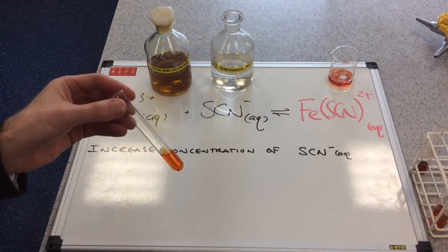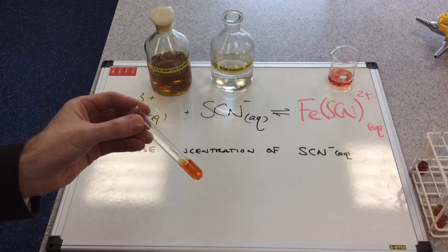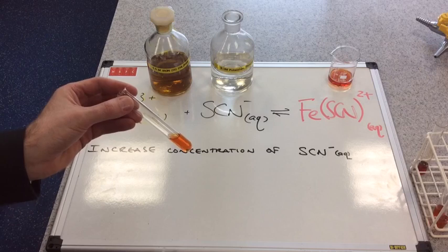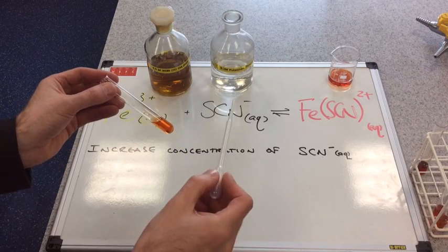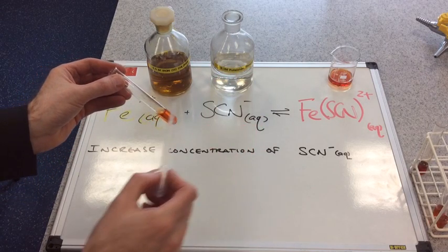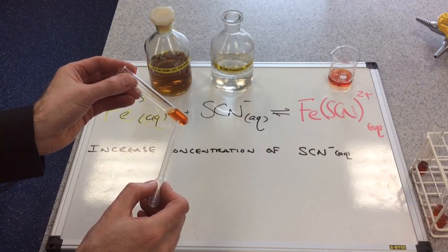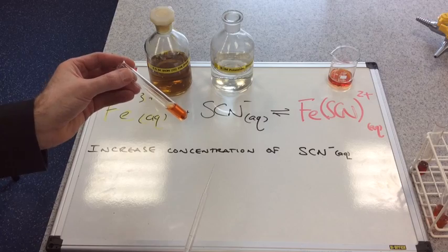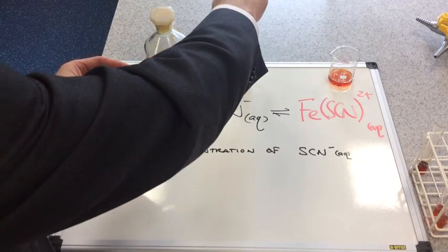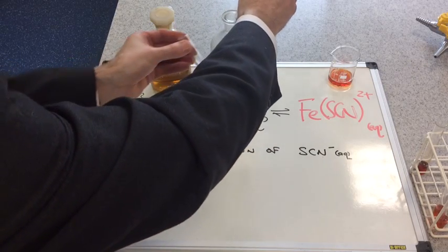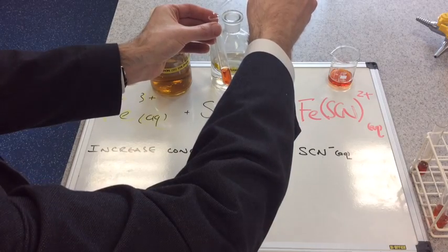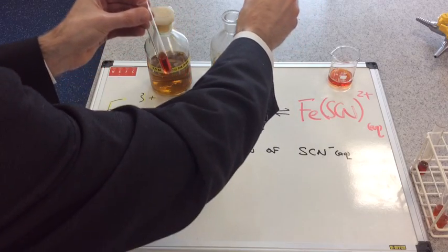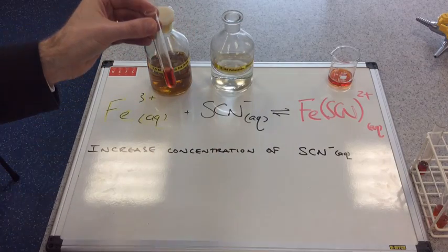The next change I'm going to impose on the equilibrium is I'm going to increase the concentration of the thiocyanate ion. So I'm going to do exactly the same thing. I'm going to get a drop of thiocyanate, add it to the test tube. This is the same color as the control tube and we'll compare the color when the new equilibrium is established. So we'll just draw a drop up, put that in. Yeah, that's happened, it's worked.